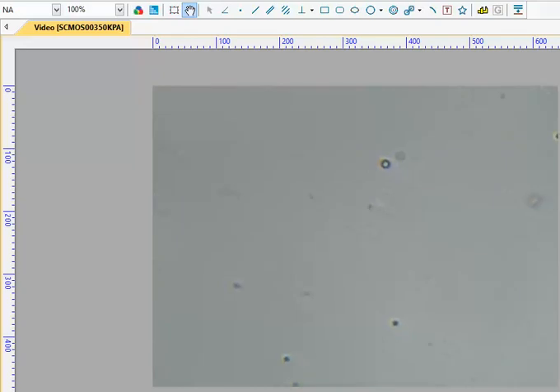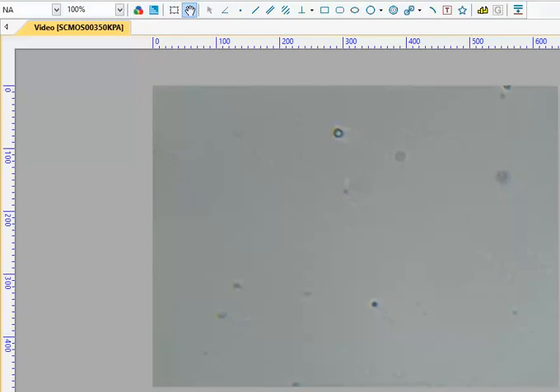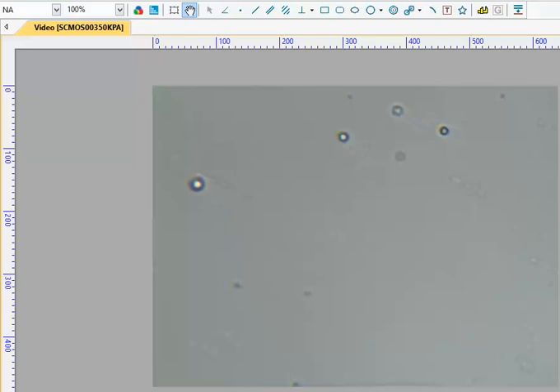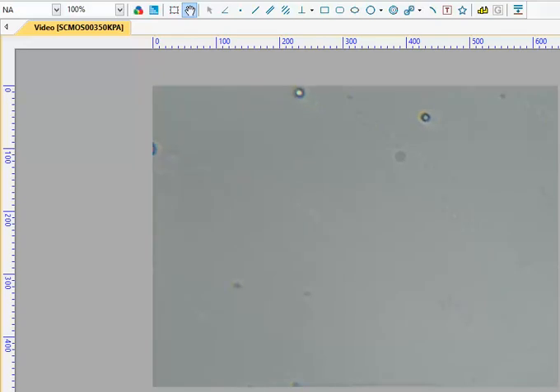So there's still quite a bit of bacteria. Hang on, I'll go tell you if that's an antibacterial soap. It turns out it doesn't have antibacterial in it. It's just Palmolive green dish soap.